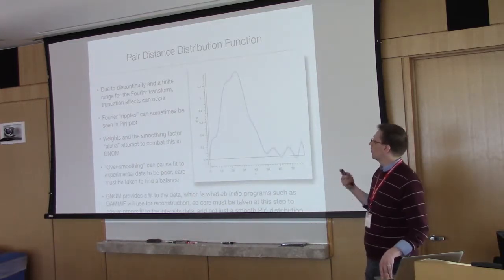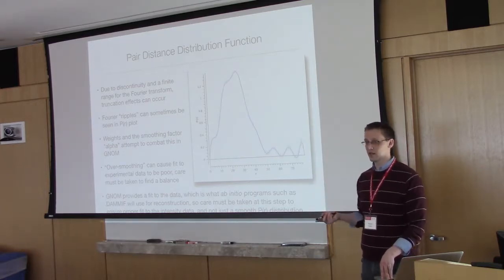So when you're actually practically determining your pair distribution function, you've got to be careful that there are a lot of assumptions that are made in the pair distribution function.